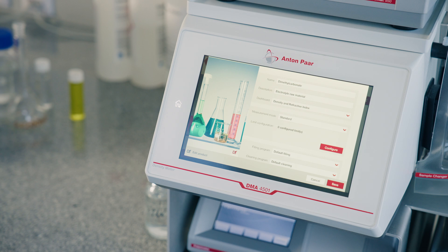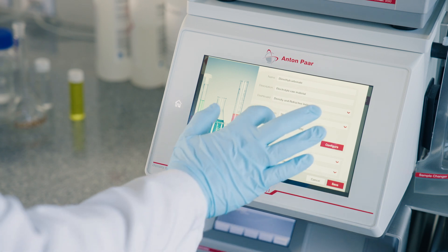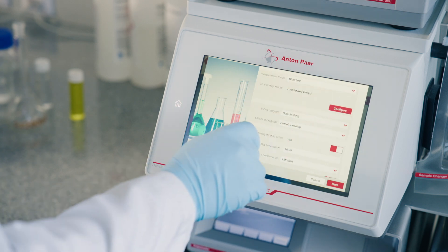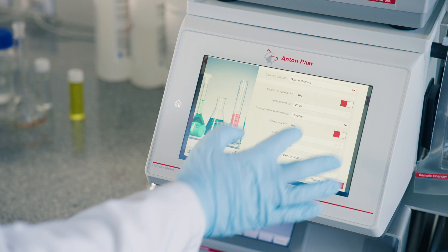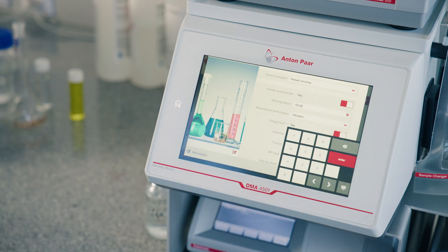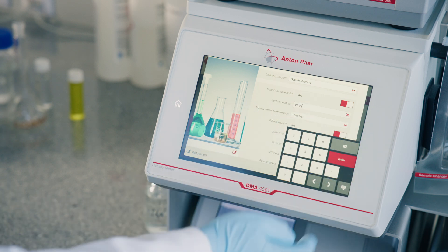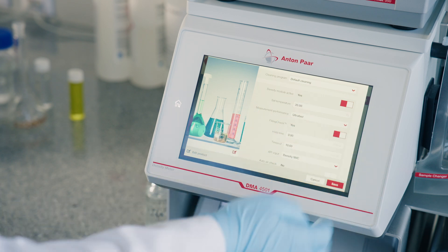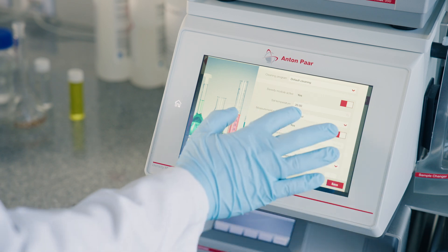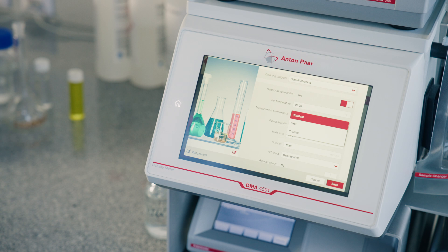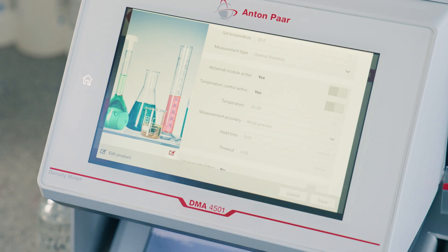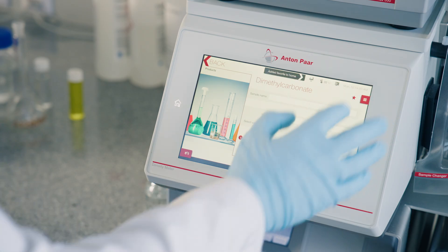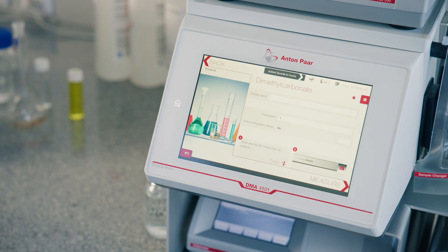Set up a method name. Set up the temperature, which is typically 20 degrees C for electrolyte analysis. Define the desired precision of measurement between precise and ultra-fast. Save and set as favorite if this is an often-used method.